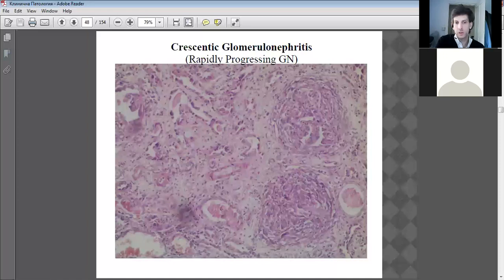Do you know which blood vessels they are? This one is an artery. This would be an artery here. Definitely an artery. Looking for a vein. I can't see. Yeah, this one is a vein, thinner walled. This is the thinner walled vein here. Thick walled artery. Thinner walled vein.